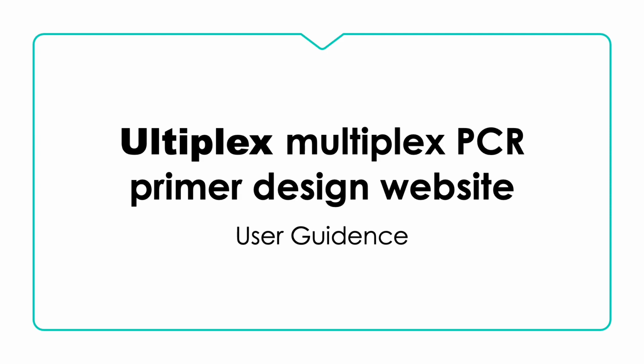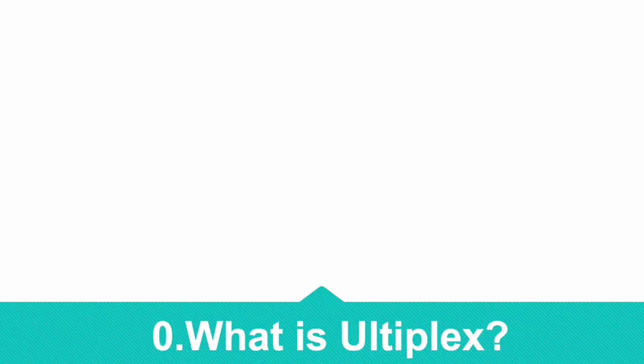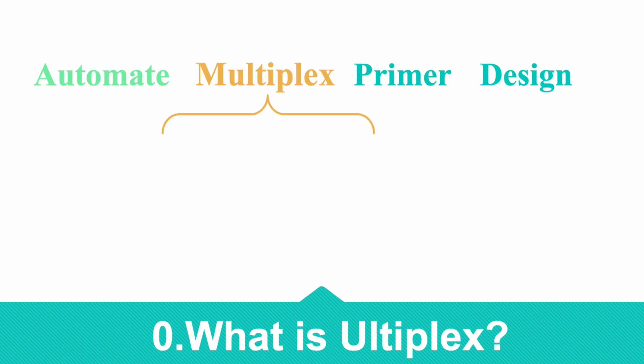Welcome to the guidance of the Ultiplex multiplex PCR primer design website. What is Ultiplex? Ultiplex is a primer design website. If you don't know what a primer is, please leave. Ultiplex is a multiplex PCR primer design website, and it is automated.